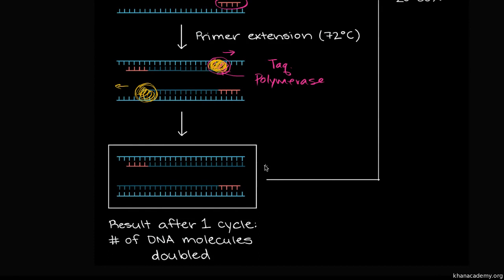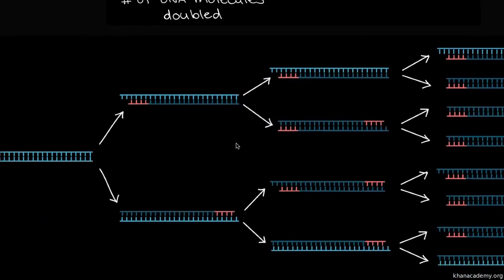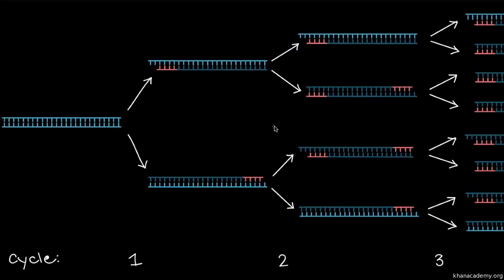So where does the chain reaction come into this? So I guess you can interpret chain reaction in two ways, and one is that's sort of what the polymerase does, it adds things to make a chain. But there's actually even more of a chain reaction dimension here, and that's that we're getting this kind of exponential process going on. So you do one cycle, you get to this situation right here. You heat it up, the strands separate, you cool it down, the primers attach, you heat it up again, the Taq polymerase does its job. And like all polymerase, it goes from the 5' to the 3' direction. We talked about that in the replication. So now you have two strands.